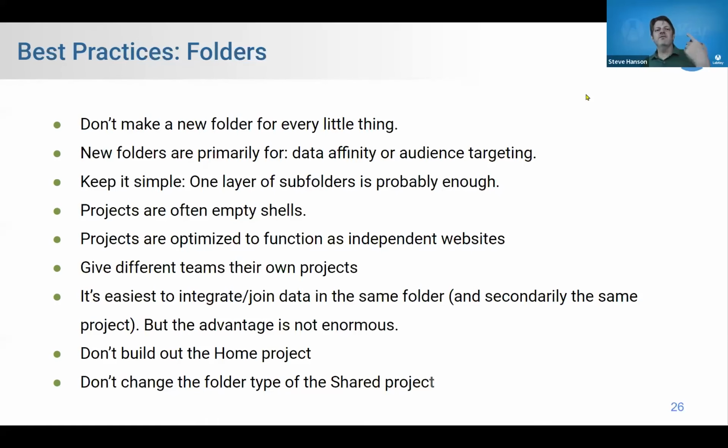And so in general, I think there's really two reasons to make a new folder. You've got brand new data of a whole new domain that doesn't go with any other pre-existing data on your site, and/or you have a new audience that you want to target, an audience that doesn't fit anywhere else on your site. Those are the two reasons to make a new folder. If you're not doing one of those two things, do you really need a new folder? Are you sure your table can't go somewhere else? Anyways, so in general, keep it simple. You don't need lots of complicated folders.